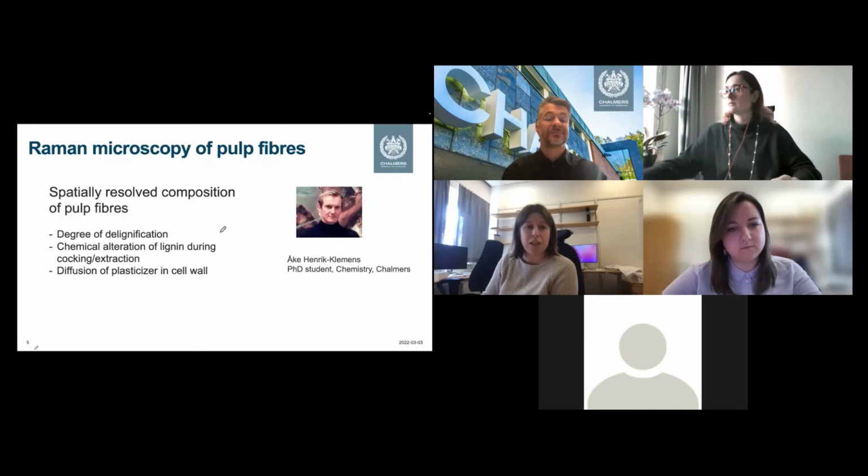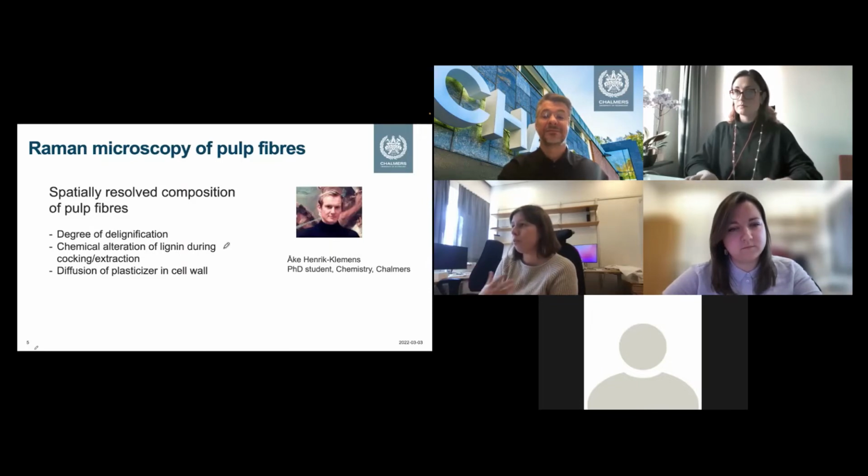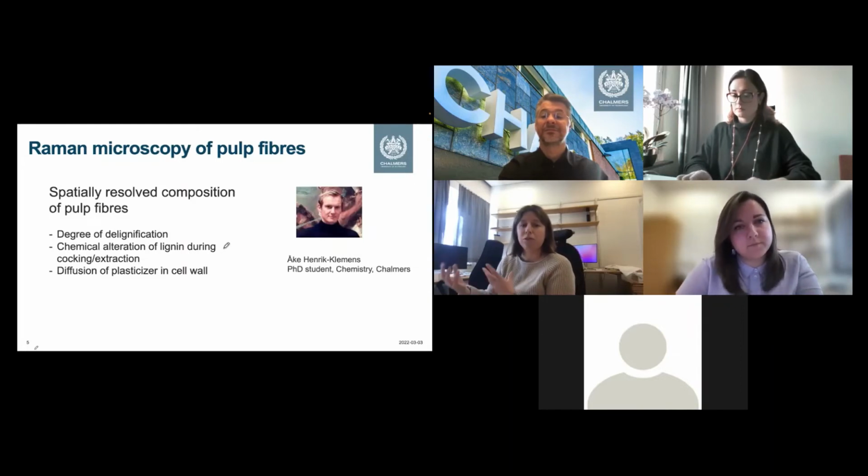And he could analyze the spatially resolved composition of these pulp fibers, including the degree of delignification, the chemical alteration of lignin during different processes such as cooking and extraction, and also the process of diffusion of the plasticizer in the cell wall.